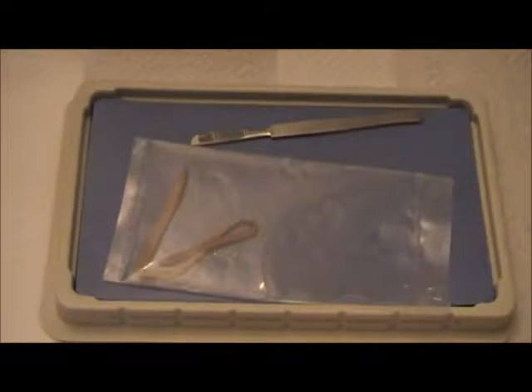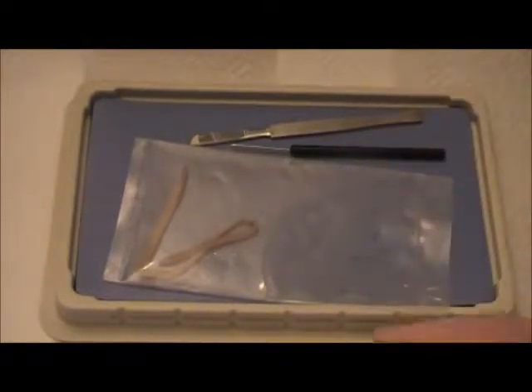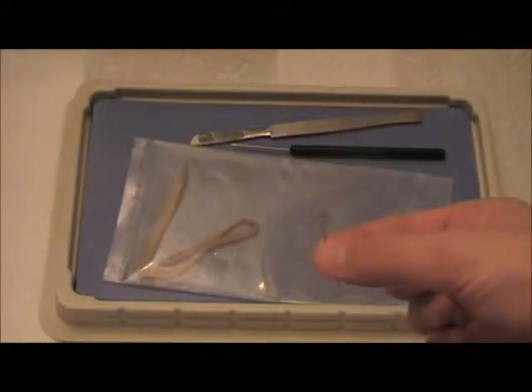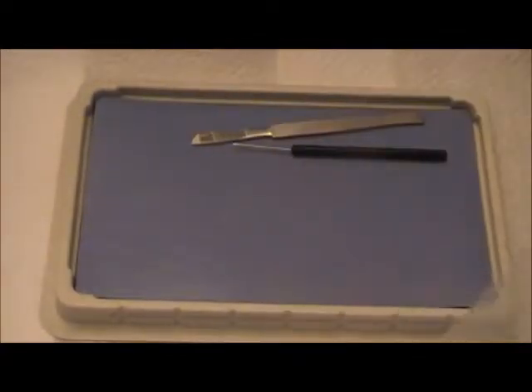What you're gonna need is a scalpel, some kind of probe, and several T-pins. So I got all this stuff from Home Science Tools, including this worm, which I thought was longer. I misread the label. I thought it was 8 inches instead of 8 centimeters, so yeah.